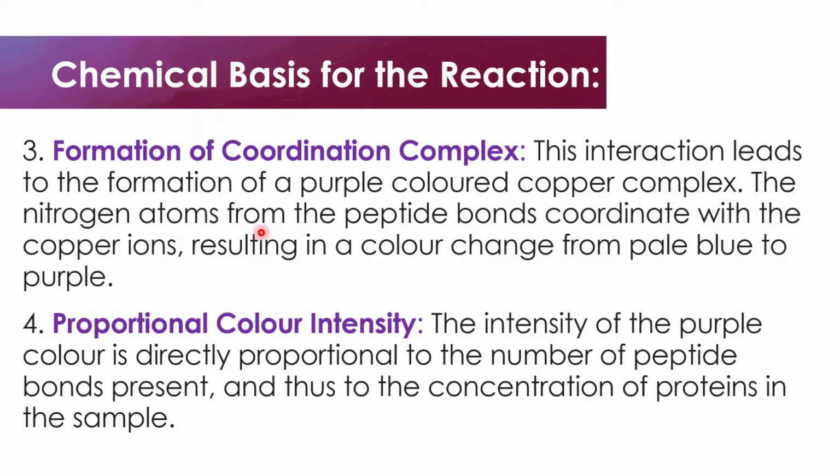The nitrogen atoms from the peptide bonds coordinate with the copper ions, resulting in a color change from pale blue to purple. So what we have to note is that the reaction of the nitrogen atoms from the peptide bonds with the cupric ions creates the formation of this complex.